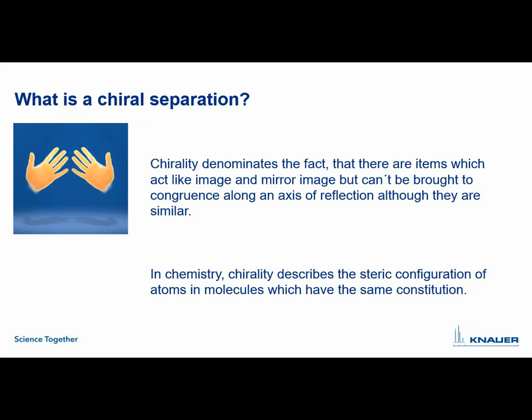And you can imagine that this is for HPLC separation a really hard task, and that classical HPLC with reversed phase or normal phase does not work here. So there have to be really special columns for that and special methods developed for chiral separations.